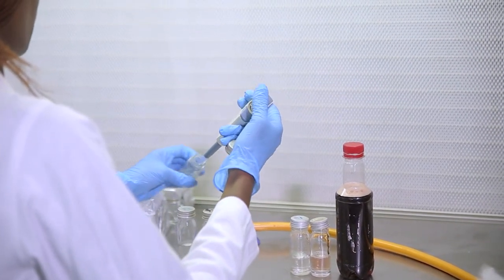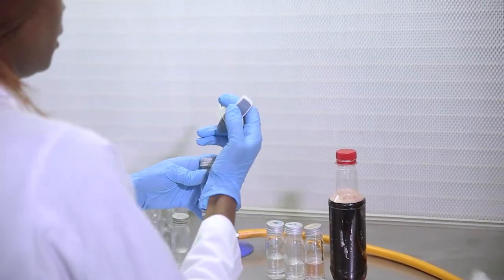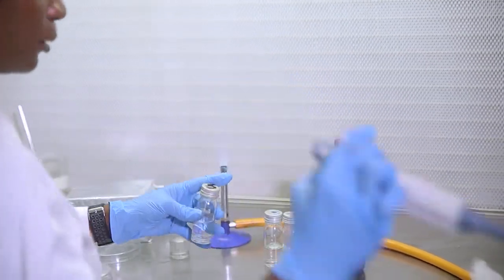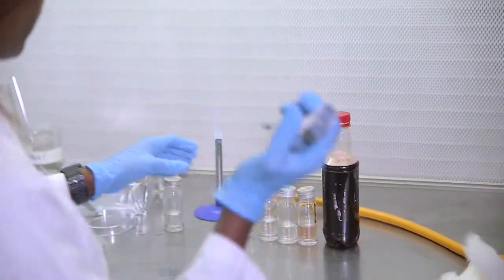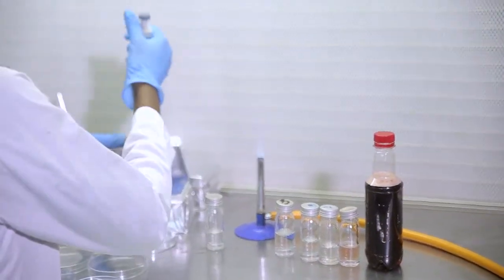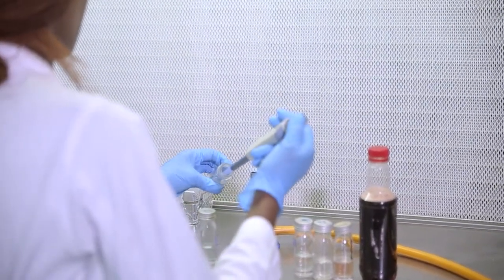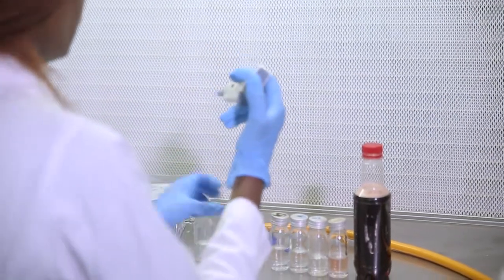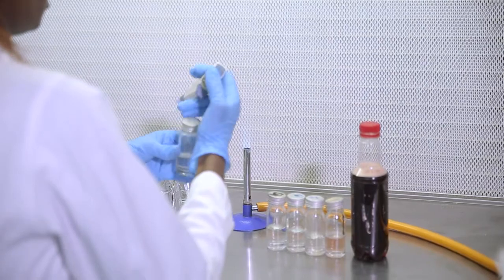I'll pick from here. And deliver it here. You keep changing the tips that you're using because you don't want to contaminate the diluent where you're delivering the inoculum. So you pick 1 ml from here, okay, and deliver it there.